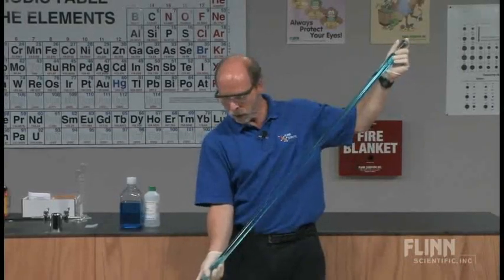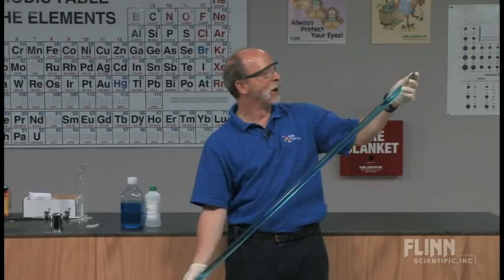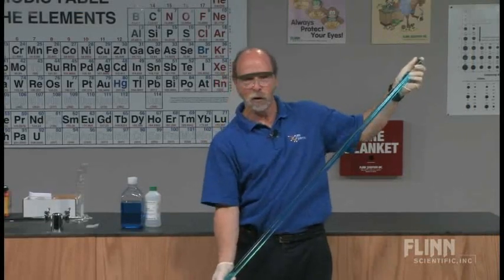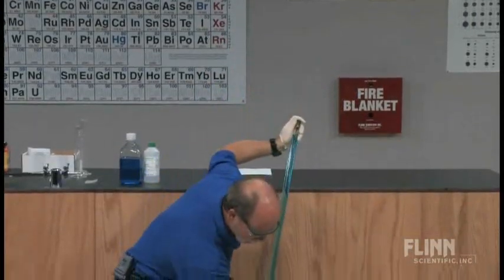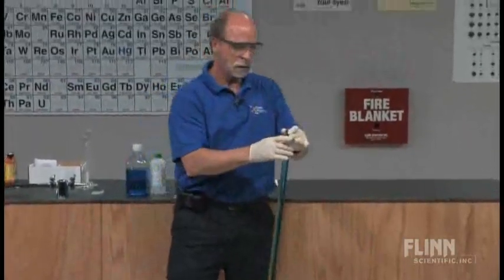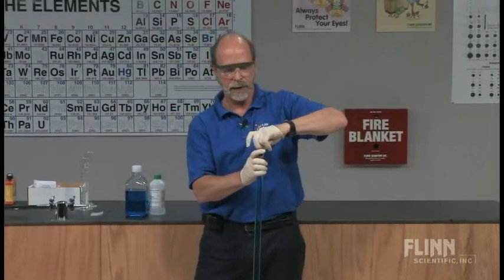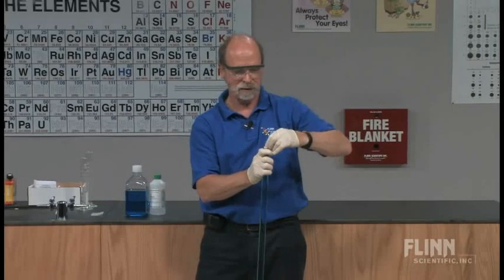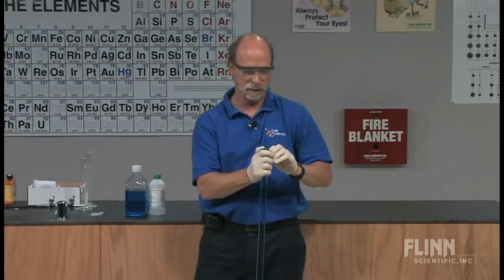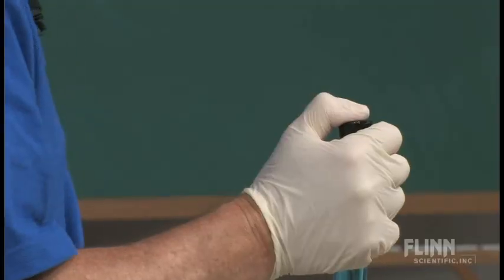Okay. Now the question becomes not only what to do with this, now that we have it, but also to explain some of the chemistry. Before I do that, I'm going to take the stopper out, and if you get the students to be real quiet, which isn't always that easy, you remove the stopper.